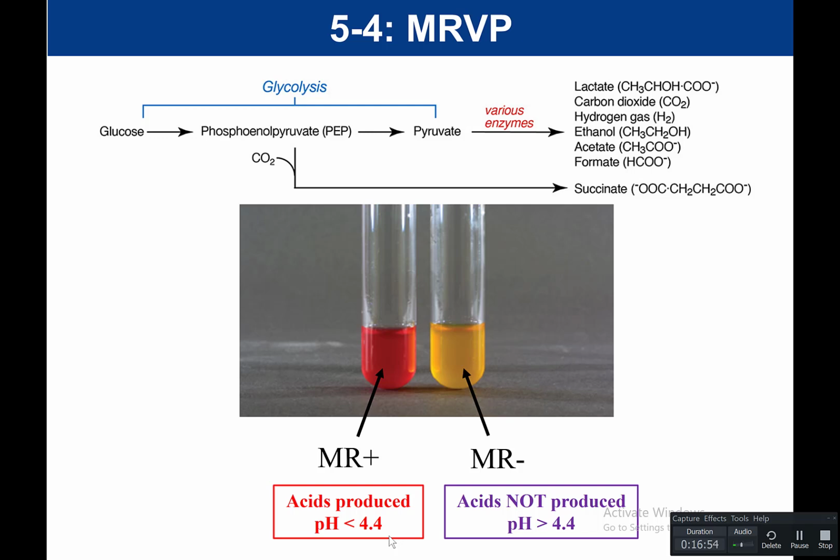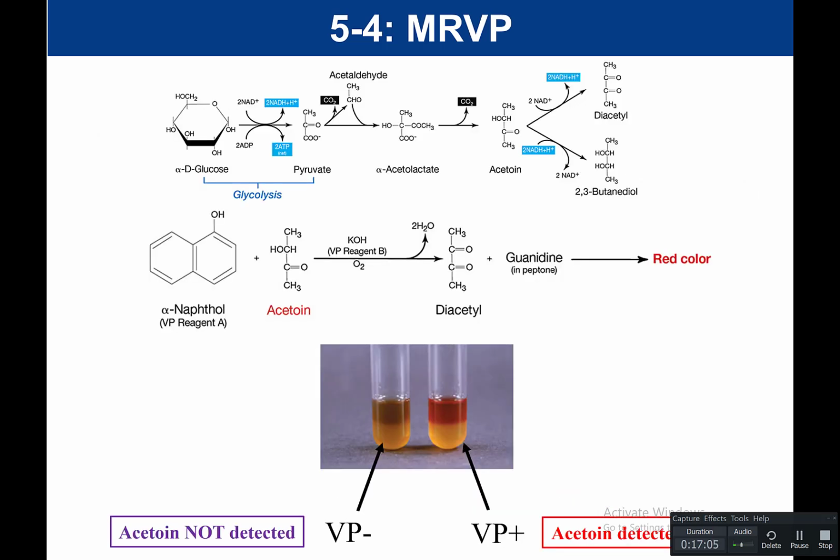So that would be MR negative. So you want to know what the positive looks like and why. What does the negative look like and why? For your VP test, you don't need to, again, memorize all of these details. I'm not concerned with that.